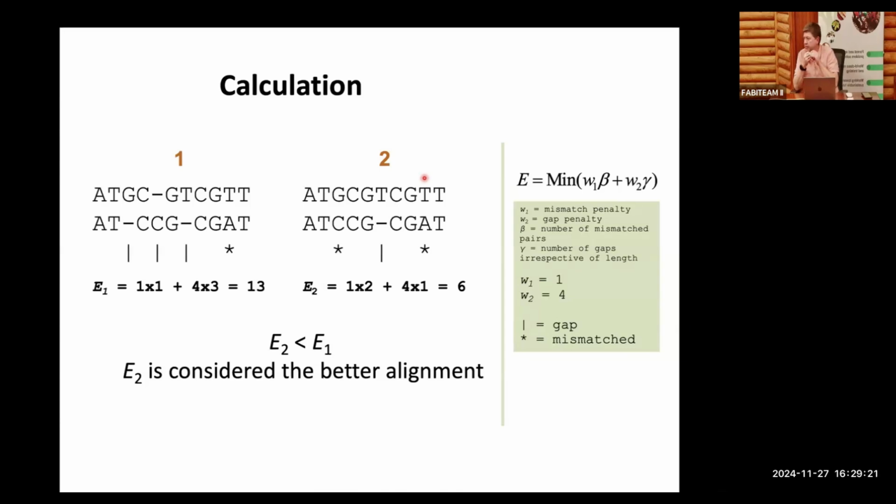The reason why I would rather leave it is because you don't know, unless you go further in and investigate it. It might be that you have an allele difference there, depending on the ploidy of your organism. So if I cannot make a call confidently, I will just leave it as N. In most cases it's not a big problem for your phylogenetic analysis. Most of our maximum likelihood analyses can cope with that, and definitely Bayesian analysis. I will just leave it.